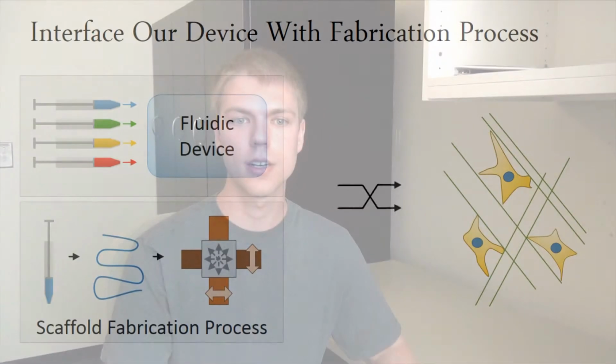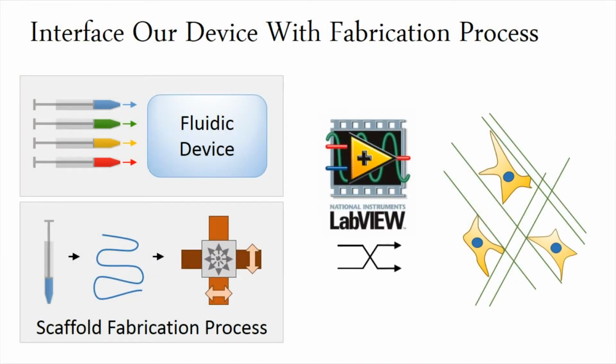After some preliminary tests, we decided that since our process was already controlled through the computer, the best way to implement our fluidic device would be to automate it through LabVIEW software. I attended a training session on LabVIEW programming and used that information to write several programs that linked our new fluidic device to the existing process.